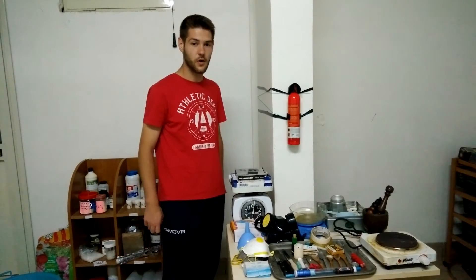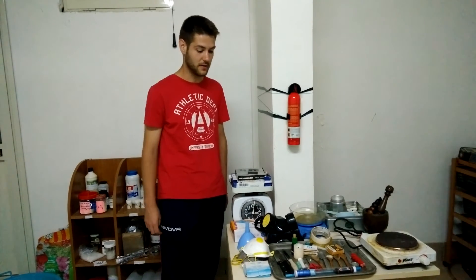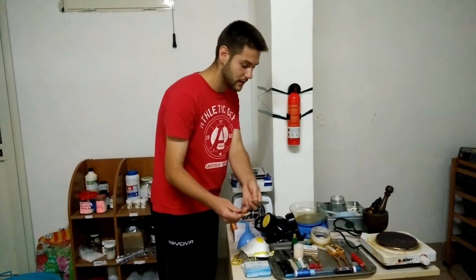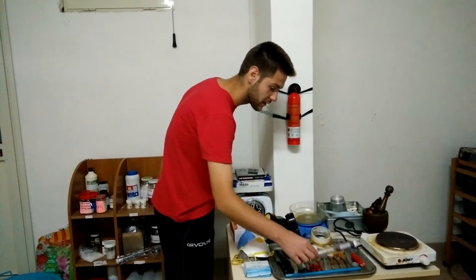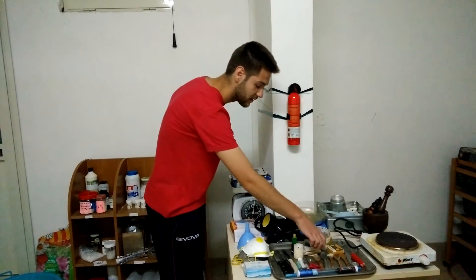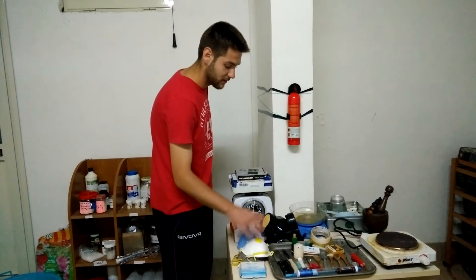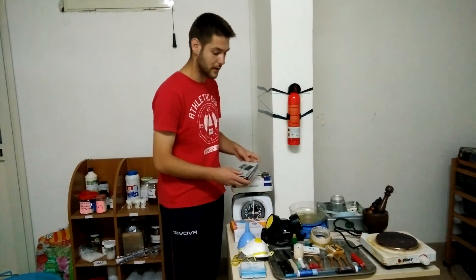An important part of our laboratory are the instruments, which we use in order to conduct our experiments. The main ones are, for example, spoons — we have both metal spoons and wooden spoons. Then we have our thermometer in order to measure the temperature. Then also we have universal paper indicators, with which we measure pH. Then we have filter papers, masks, and safety goggles.